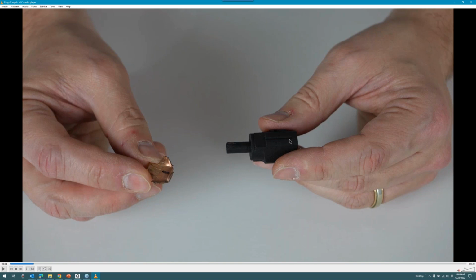And also another thing about that dash is that when the stub is aligned to be placed onto the bullet rotation shaft of the acquisition unit, the alignment of that is always pointing straight up at 12 o'clock. And so if I get my fragment, and especially the area I'm concerned about within the fragment, in line with what is going to be pointing straight up at 12 o'clock, well, that means that all I need to do is maneuver that underneath the camera, and I should be looking at the exact area that I'm concerned with for this particular acquisition. It takes a lot of the guesswork out of the process afterwards.